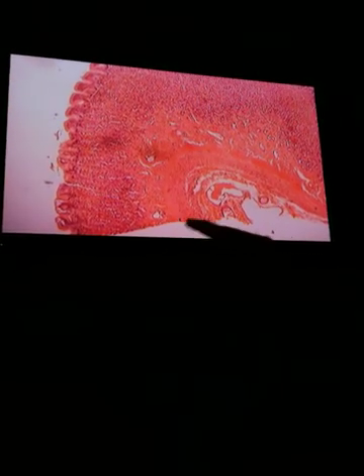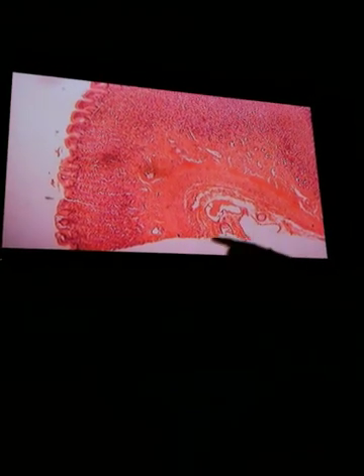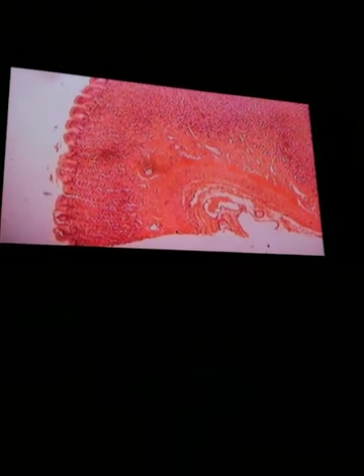This is a smaller representation. You have the oblique, here's the longitudinal, and the circular is right in the middle. You can see the difference in the patterns as you look at them. There's some difference, and you'll be able to pick it up. But it depends on what they're looking for.